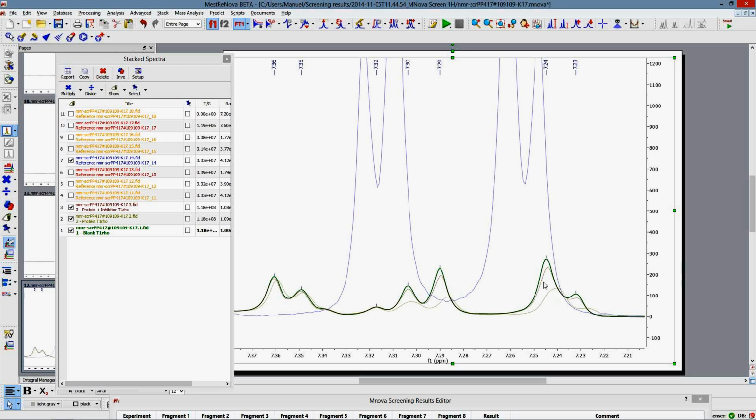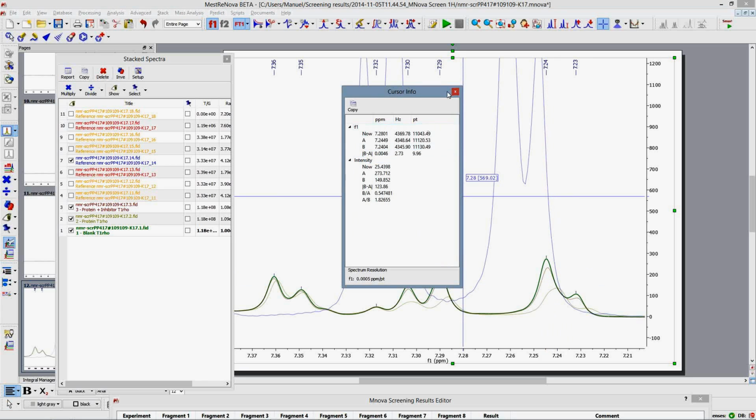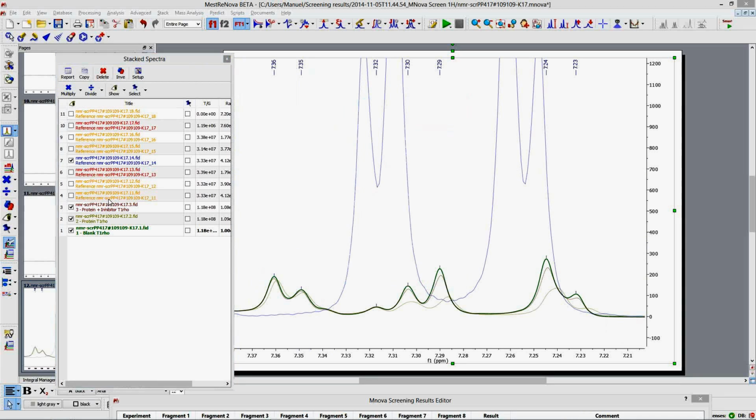but that's within our limits. We can check that very quickly. So that's going to be in the 2 Hertz region. I think we set up all the way to 2.5 multiplied by line width, so we are going over the 3 Hertz region, so we should be absolutely fine. Okay, but what we are more interested in is making a quick visual inspection.